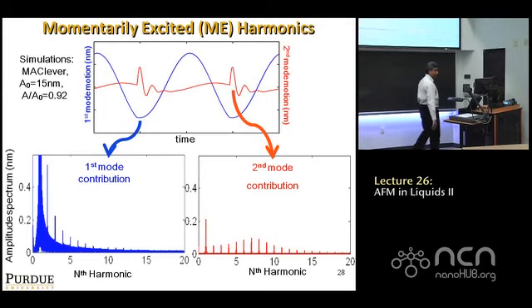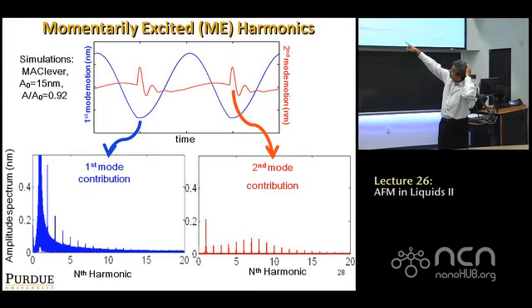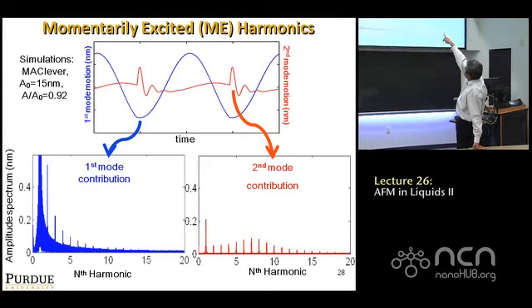So the key point here is that when you are trying to access this little ringing that happens, one way to do it is to keep in mind that the first eigenmode is oscillating in blue, and if you look at higher harmonics, you get certain high harmonics. The key thing is we're trying to capture the ringing in the red curve, and the ringing is at the second mode, and remember the second mode is between 6 and 7 times the frequency of the first mode.